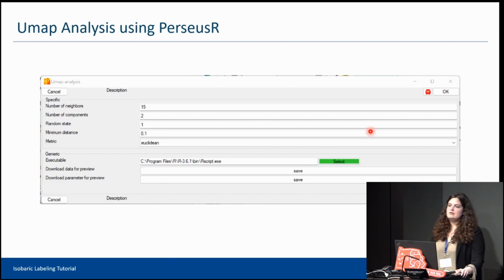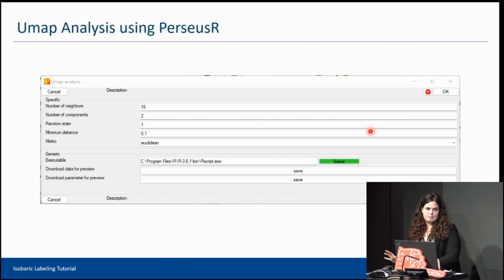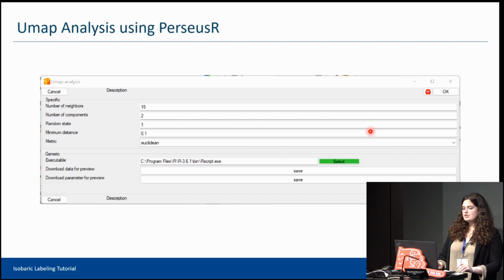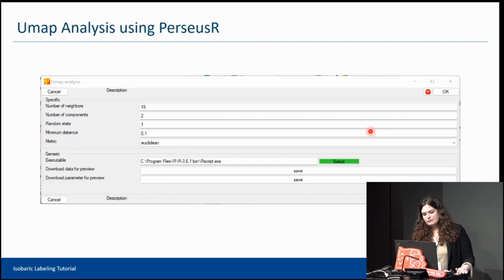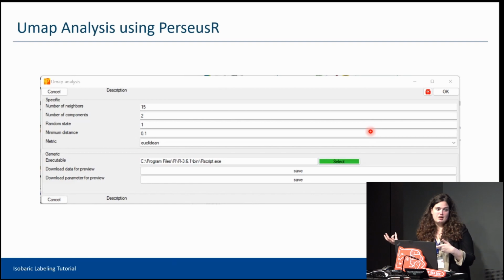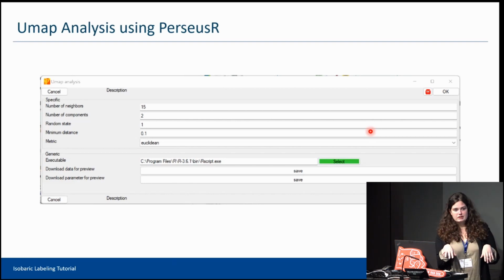So it means that you go to Visual Studio, you develop your plugin, fine, but then when you generate it, if you then want to use it in Perseus, you just have to go to R, to executable R script, and install Perseus R. As you install our other package in RStudio, you need to install this one.